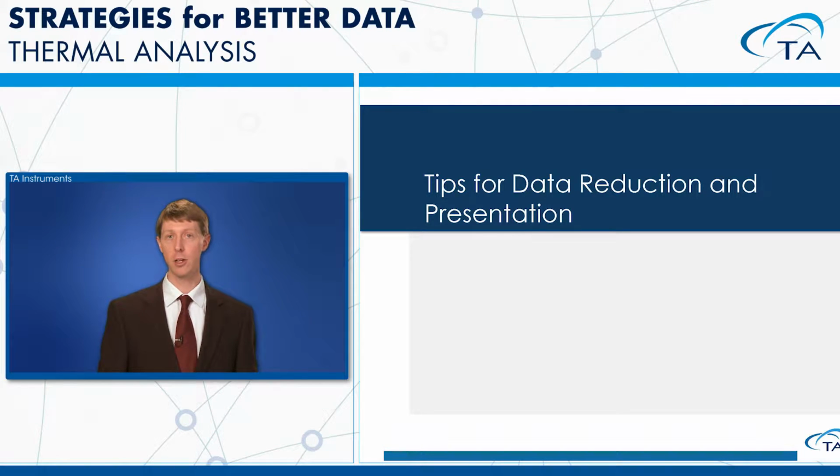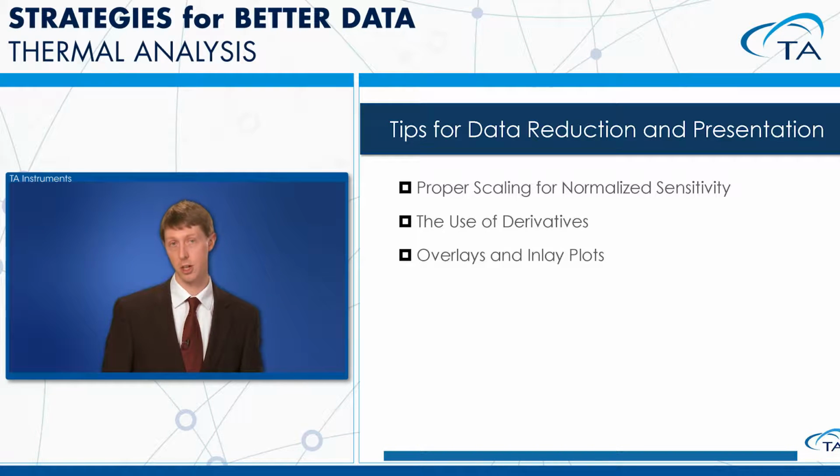Hello, I'd like to welcome you and thank you for joining us on this third and final segment on strategies for better thermal analysis data from TA Instruments product specialists. Our segment today will discuss general data presentation and analysis. So I'd like to start out with some tips on data reduction and presentation.